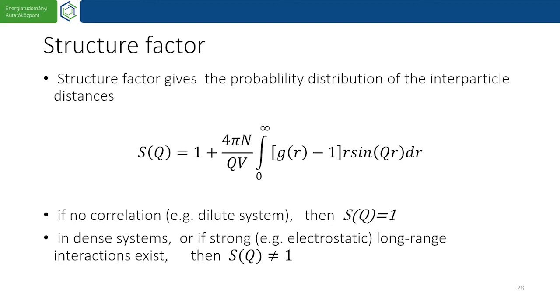And in the other case, if we have charged particles, then depending on the charge, they repel each other more and more strongly. In this case, very often we cannot even reach such a dilute system which would not interact. This usually happens for micelles, because micelles are made of surfactants, and surfactants are basically ions, and a part of these ions are always dissociated in the solution.